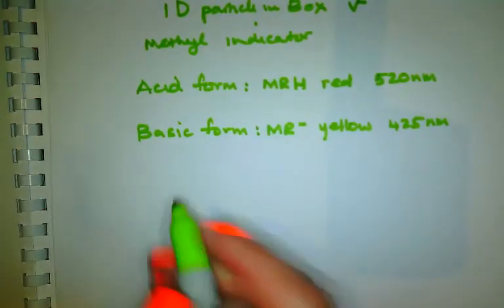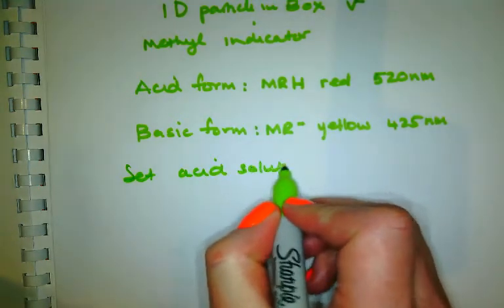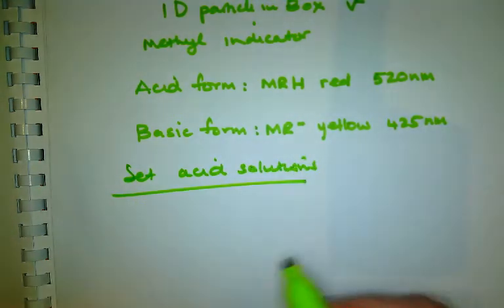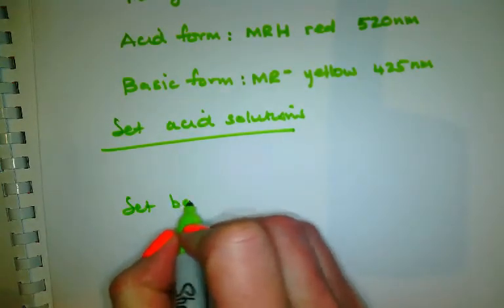If we summarize that, we're going to have a set of acidic solutions, different dilutions. We're going to have a set of basic solutions.